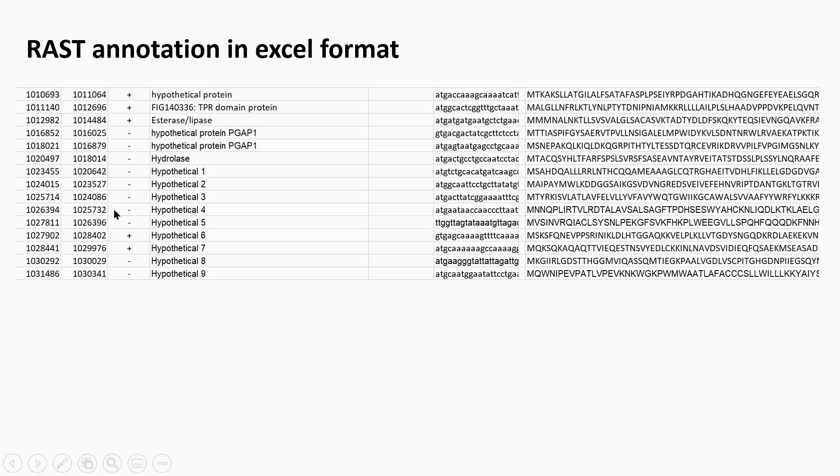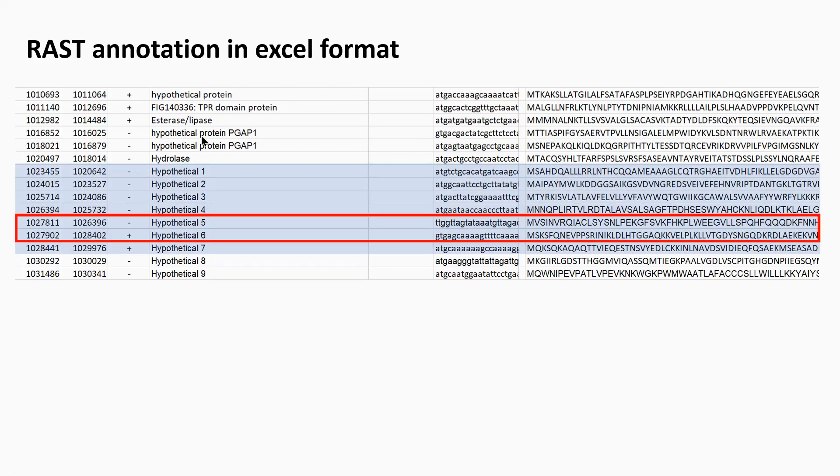I was interested in looking at these genes here, so hypothetical one down to seven, and I noticed something as I was going through, especially with these two here, hypothetical gene five and six.